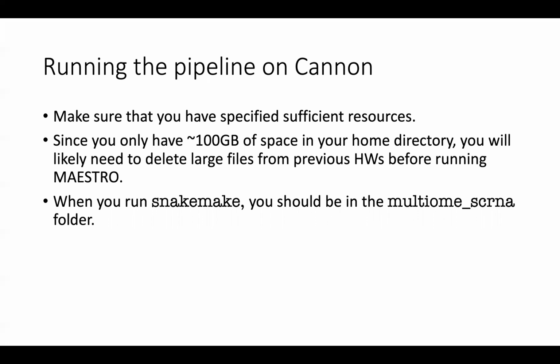I think you probably need 30, 40 gigabytes of scratch space to run the pipeline. So make sure that you're deleting your old index files. If you have a genome index file from the previous homeworks, I'd just go ahead and delete that so you have enough space to run Maestro. Yeah, and also, when you call Snakemake, it's going to look for that metadata file, that YAML file. So you should make sure that you're in the correct folder that actually has the metadata file when you submit your job.